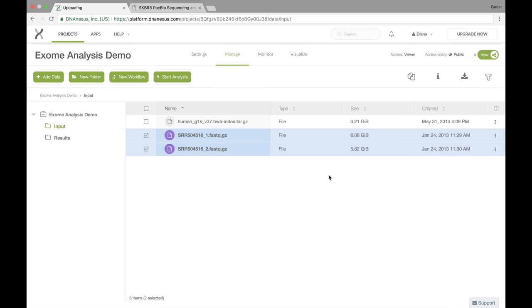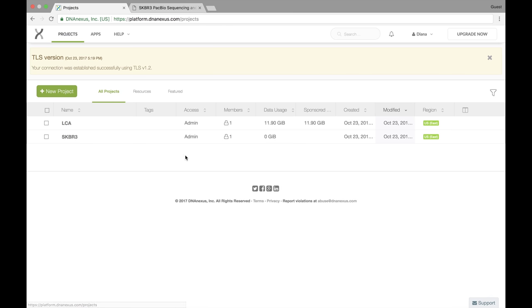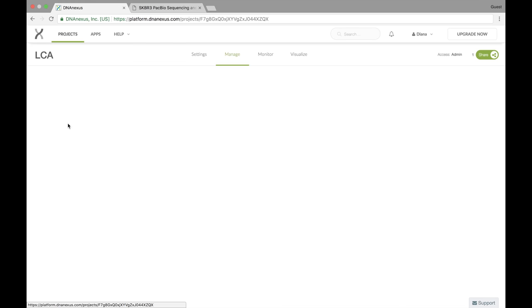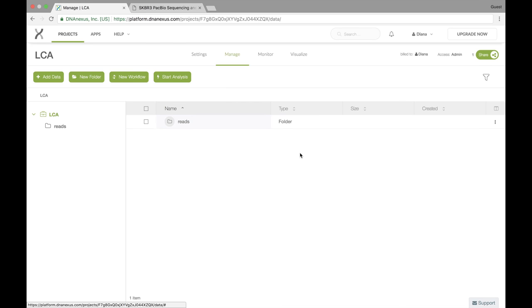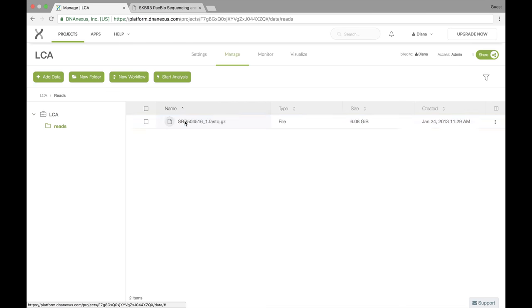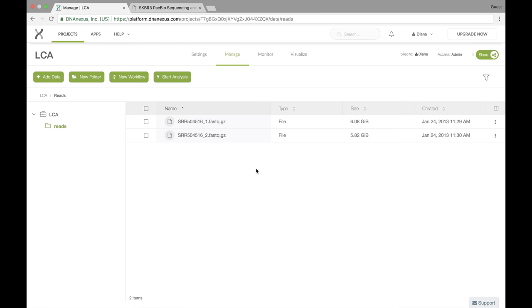So we click done. And now we're going to go over and look at our new project. And we can see in here in the LCA project that the data is already in here in our reads folder.